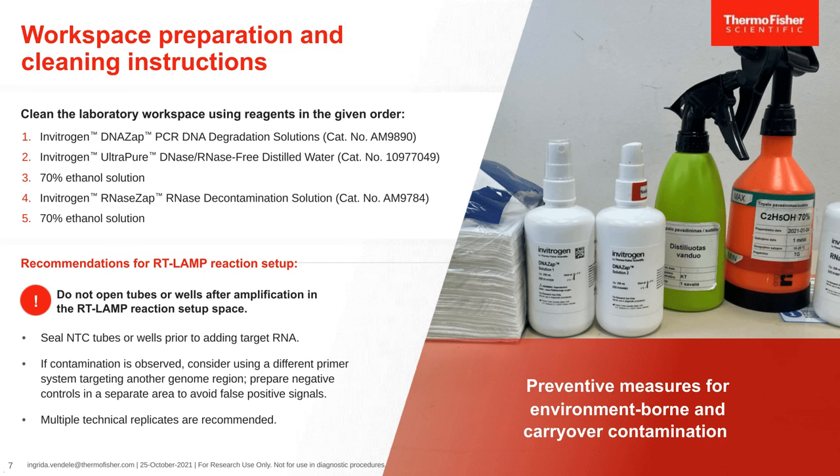ethanol solution. However, the most important recommendation is really to not open tubes or wells after LAMP amplification in the reaction setup space, to prevent amplicons spreading on the workspaces and contaminating, causing a false positive signal in your new reactions. Also seal your no template control tubes or wells prior to adding a target RNA or DNA.